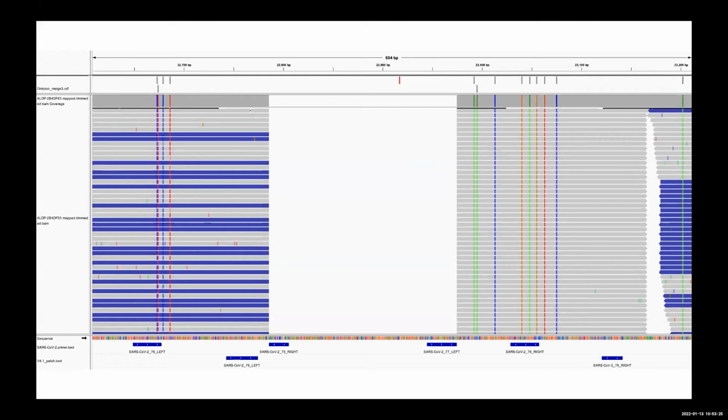So I want to talk a little bit about the problems that we saw when Omicron was detected. It's characterized, like other VOCs, as having a very large number of mutations, particularly in the spike protein. Let's just show a region of the genome here where you see 4 clustered mutations here, and 8 other mutations here, and multiple hits to the primer binding sequences.